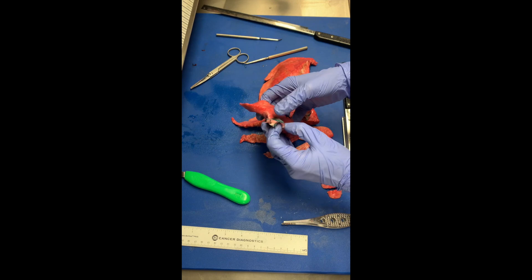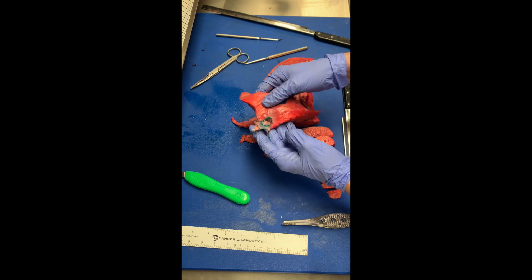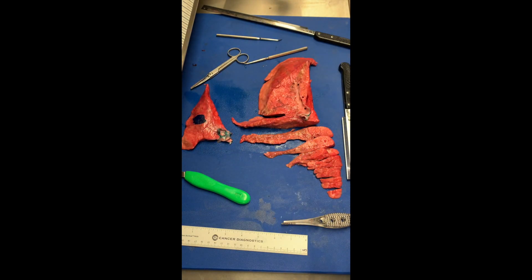Make sure that you also shave your margins and take your representative sections. You'll need tumor to closest airway, tumor to pleura, and tumor to uninvolved. Make sure you have representative sections of each of your lobes — one to two sections will suffice. I hope you enjoy this lab.